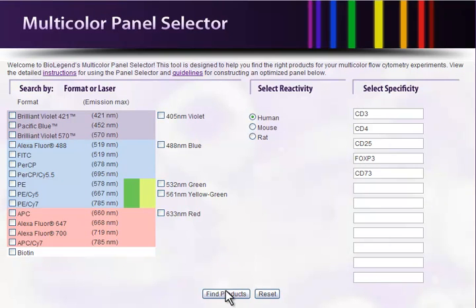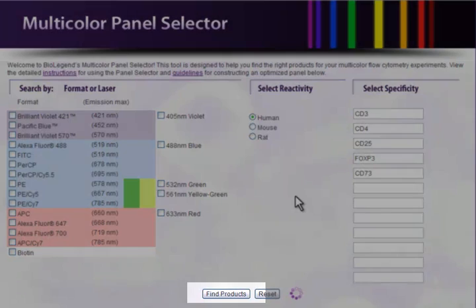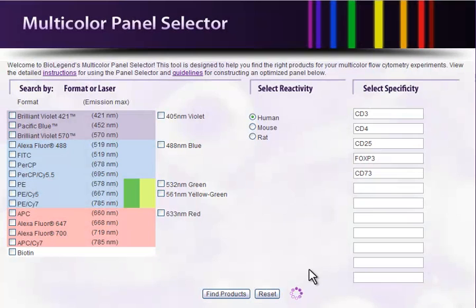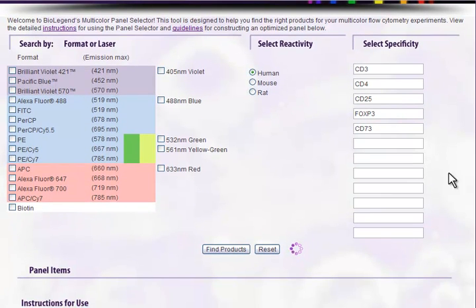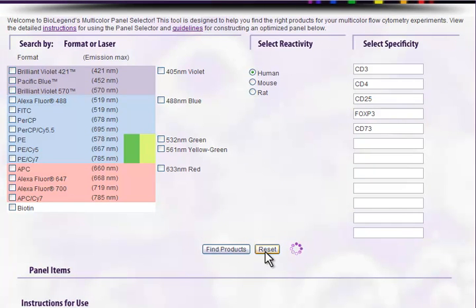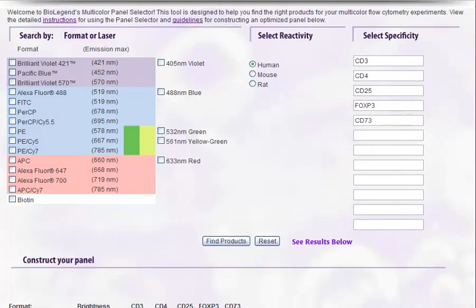When you are ready, click Find Products. The spinning wheel indicates that your products are being searched. The reset button here will clear all of your information if you are ready to do a new search.